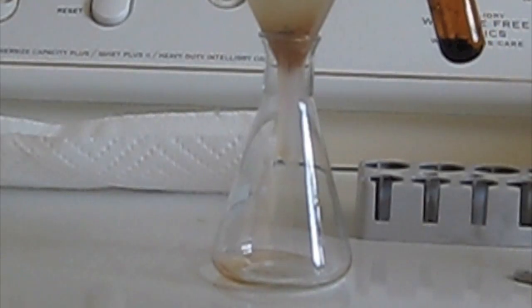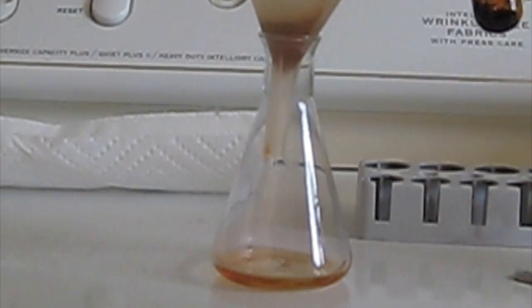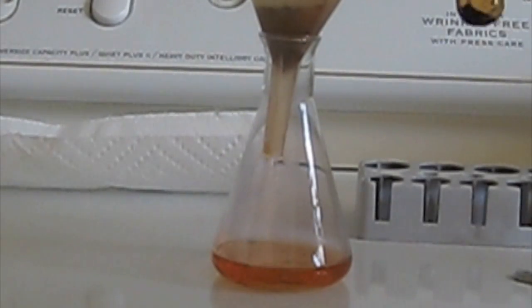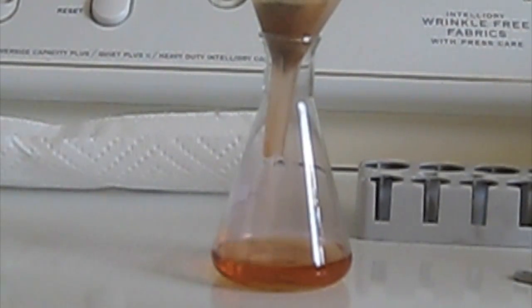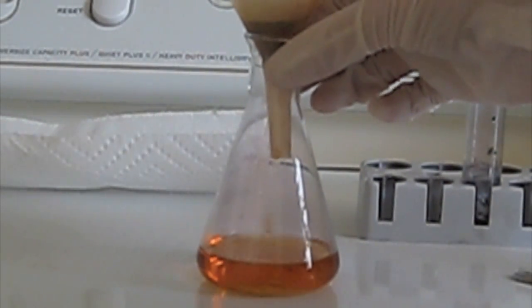Zooming in here. It takes a while to filter, so I'm going to speed this up a lot, 8 times its original speed. Most of the iodine stays as a clump in the test tube, so the only reason to filter would be to get out the little bits of iodine that are on the walls of the test tube. I'm about done now.